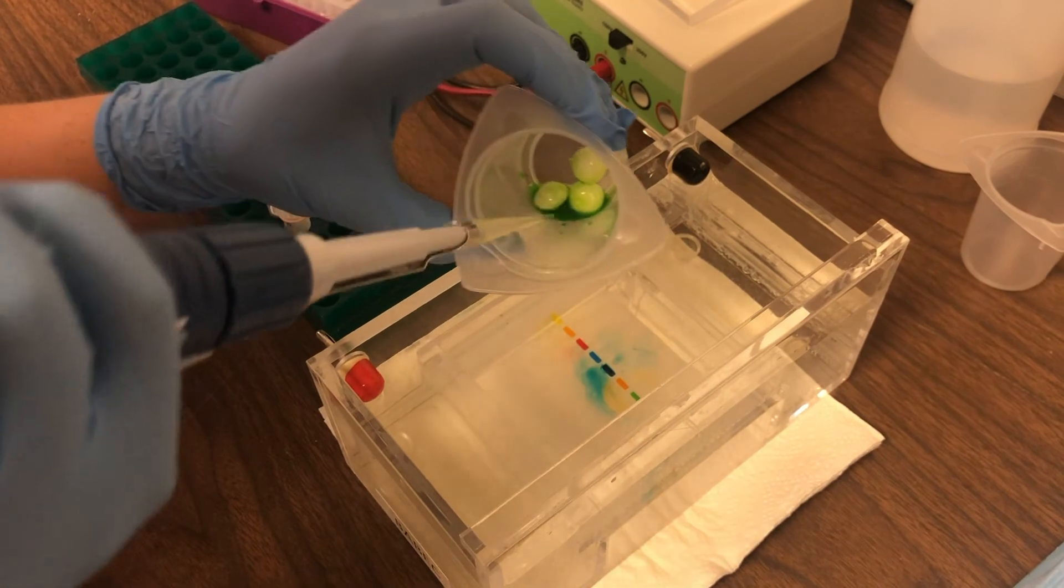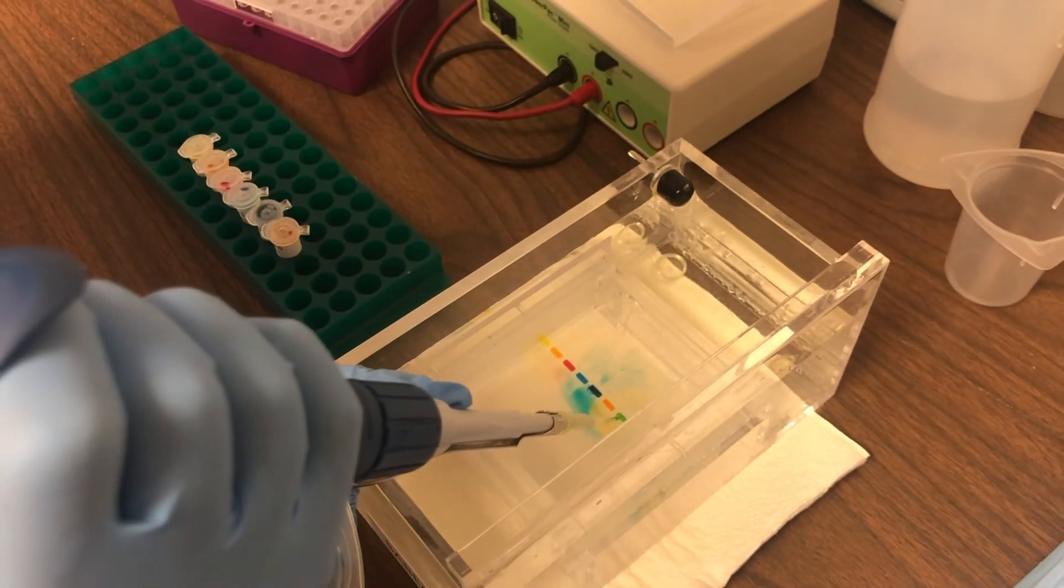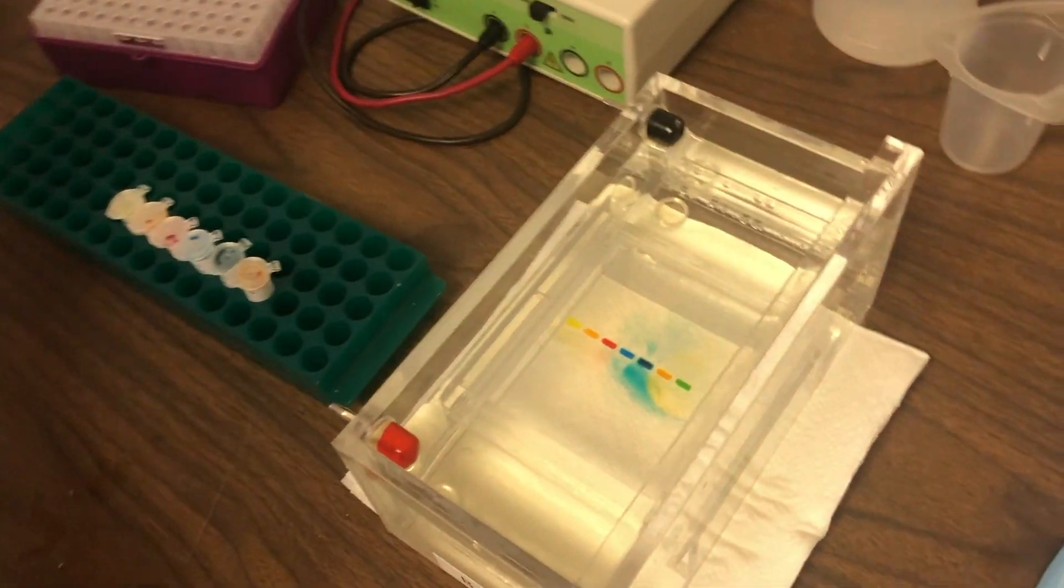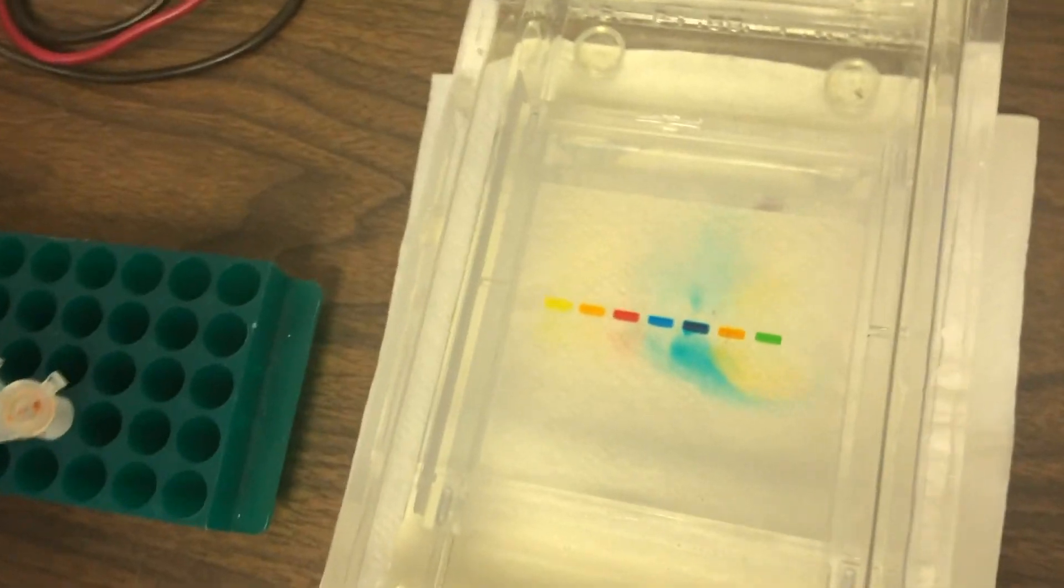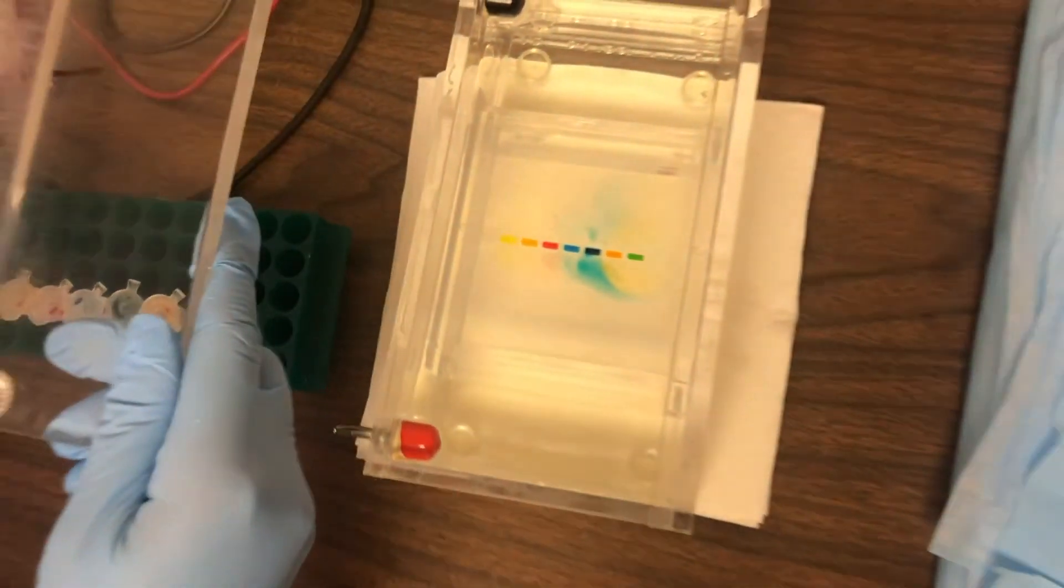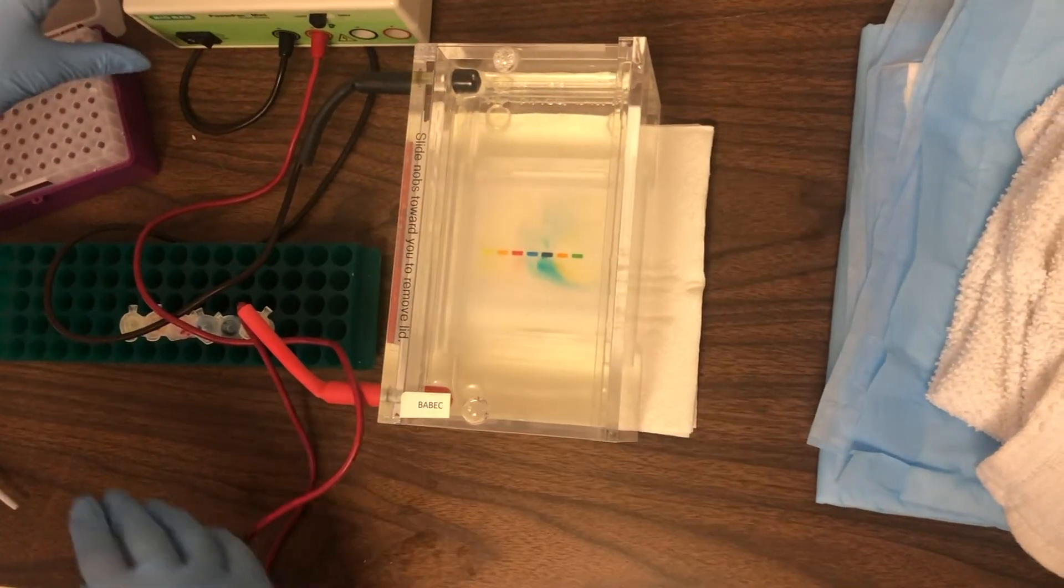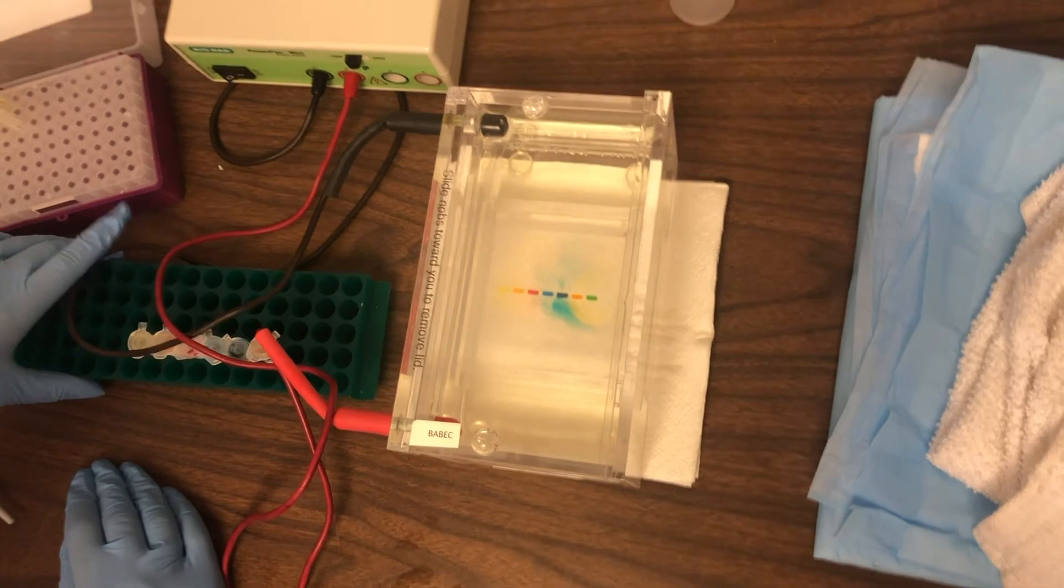So we're skipping ahead. We're adding the liquid from the outside of the green Skittle into lane 7. And as you can see, we have now loaded all seven of our samples and we're putting our lid on top of the electrophoresis box and starting the electricity through the gel.